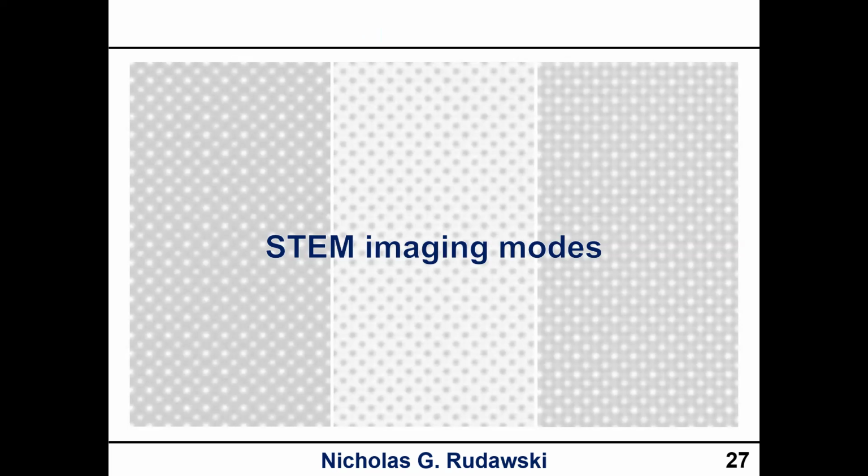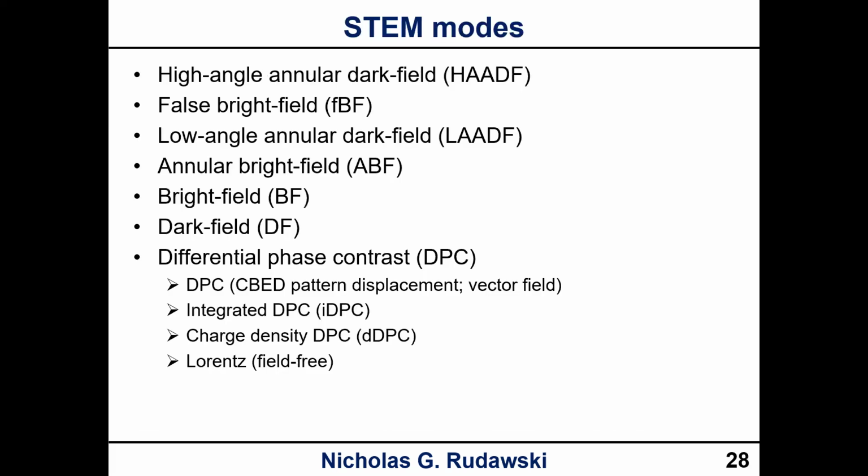Now we're going to talk about how we can do STEM: the STEM imaging modes. And there's a lot of them. If you actually look through and do a proper accounting, there are many different ways you can do STEM. There are really 10 unique ways here.